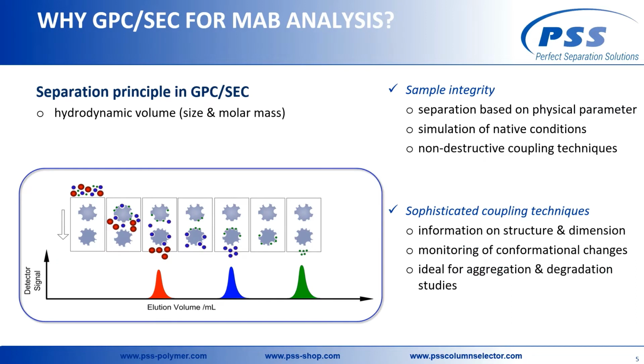While on the previous slide the elution order in the GPC-SEC was visualized, here we have a closer look at the stationary phase and how it is even possible to separate complex but also globular proteins only by their size. GPC-SEC columns are filled with porous particles differing in particle and pore sizes. Typical particle sizes in analytical GPC-SEC range from sub-2 micrometer particles applied in oligomer and protein separations to approximately 20 micrometers for separations of ultra-high molar mass macromolecules or for fractionating larger sample amounts.